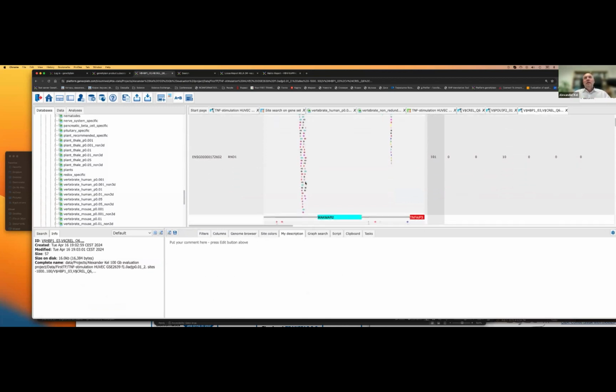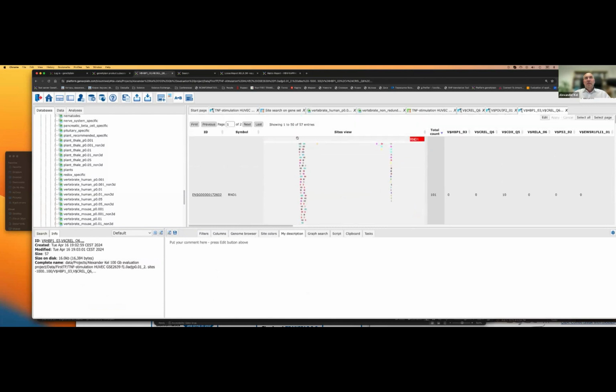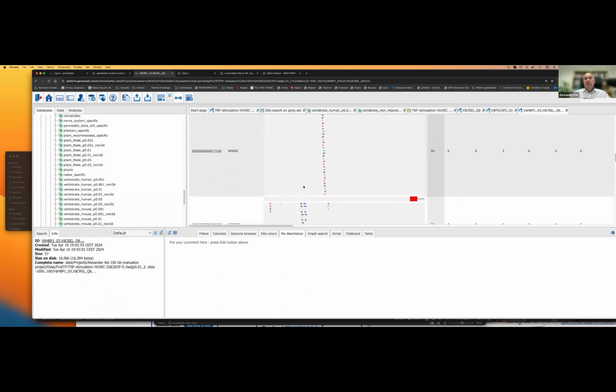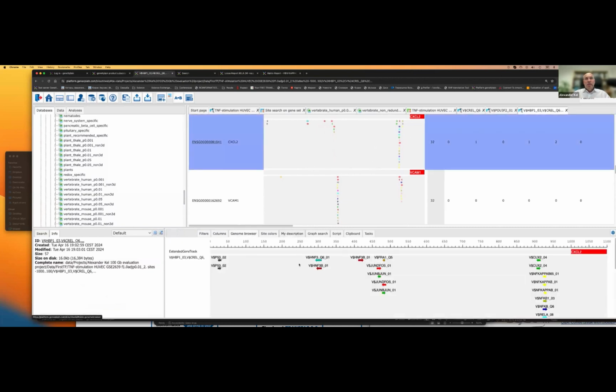So you see now these pictures of the sites, and interestingly, you often see these clusters, which happen in some particular positions of promoters, which means it's not only one factor which is here. You see it maybe in more detail like this.